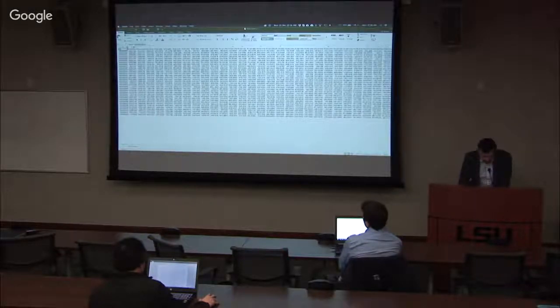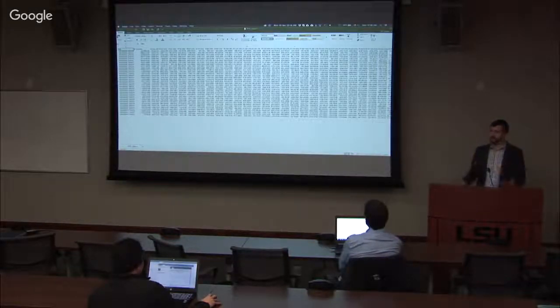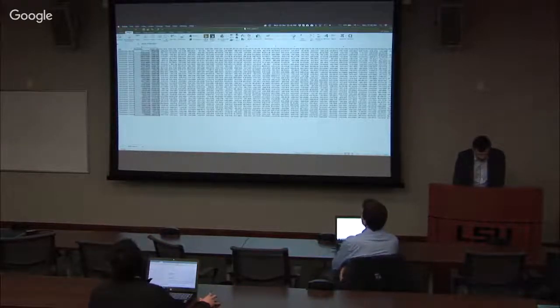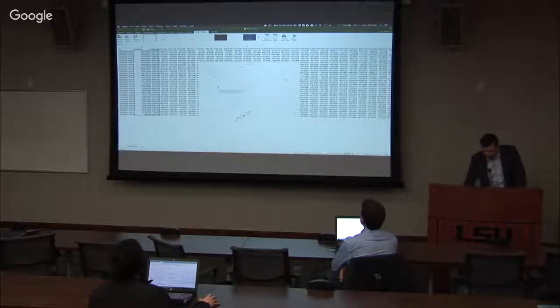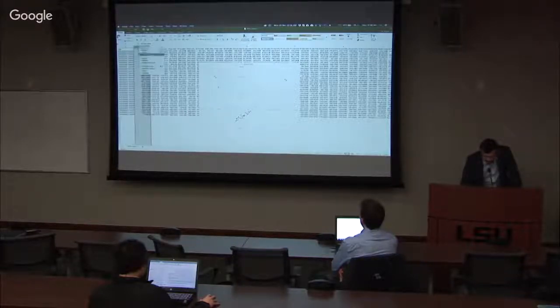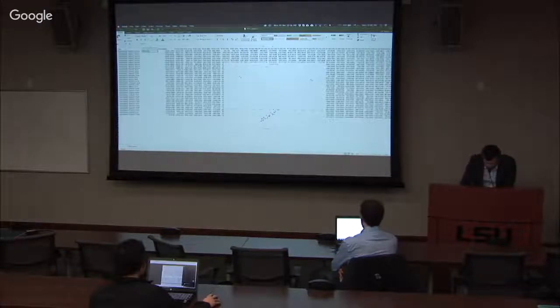So what I have here is my principal components, those projections in the space that describes my samples. These two could be chosen to represent my data set. I can see that some of them are right here, and the rest are down here. So now I can mark them. Here we have the annotation within the name of our samples, so you can see that all of these are normal. Let me insert some groups here. These are all of my normal, and these would be all DCIS.